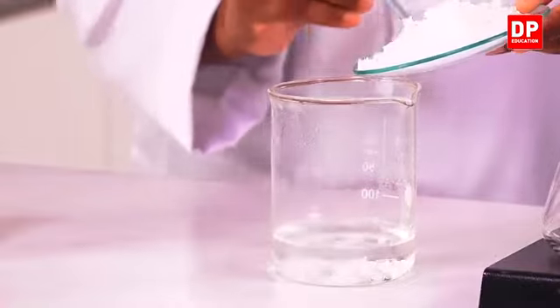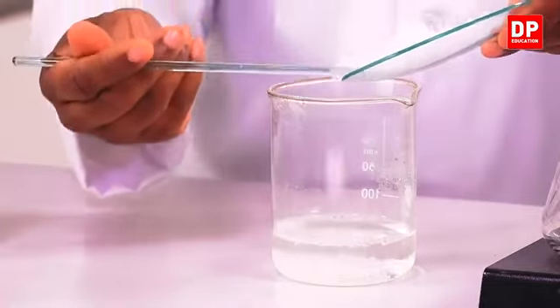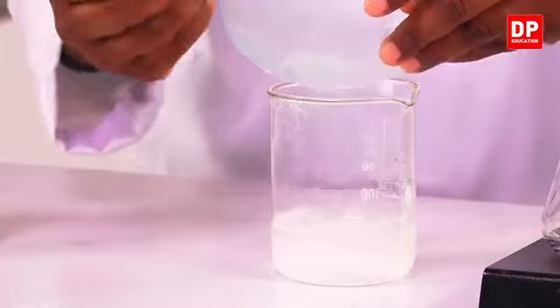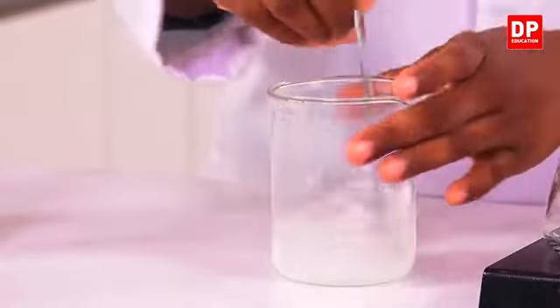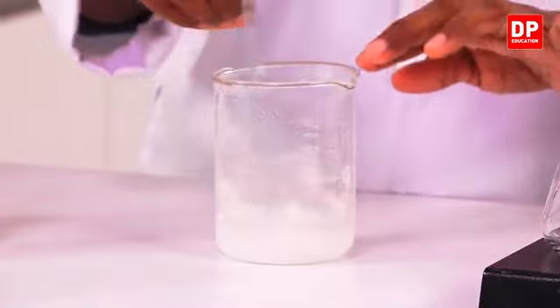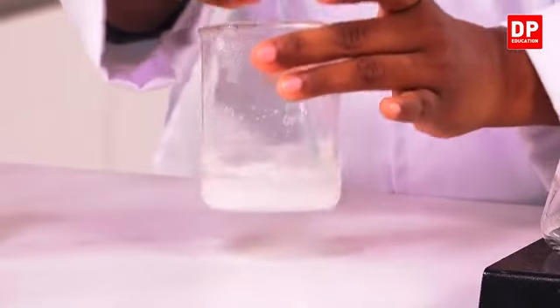You all know that when the temperature of the solvent increases, the solubility increases. So, here we are going to dissolve salt in hot water. And during this process, we are going to remove the impurities present in salt and get the pure salt crystals.